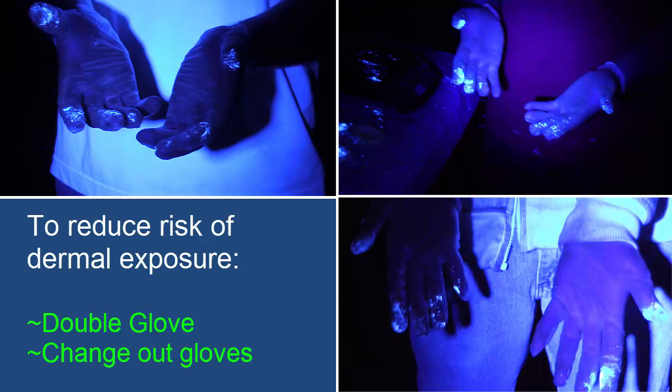Dermal exposures during glove use may occur as a result of sustained contact with a solid or liquid contaminant. Here are the contaminated gloved hands of the students who carried out tasks in this activity. Some tasks may cause gloves to become permeable and as a result cause the contaminants to linger or penetrate through the gloves and onto the skin.